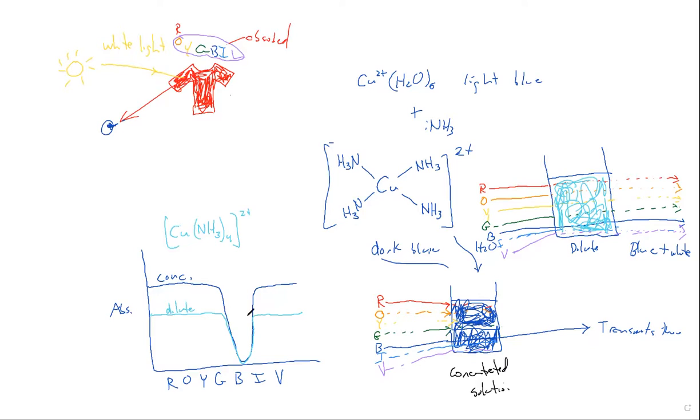And so what kind of light should I shine through my sample to determine the concentration? On the spectrophotometer, you have to figure out the wavelength. What wavelength do you want to shine through your sample? I believe the red is like 700 nanometers, and the violet is like 400 nanometers, in that range. What kind of light should we shine through our sample if we want to determine the concentration? What color? Pick a number. Do you think we want to shine the blue light through the sample?